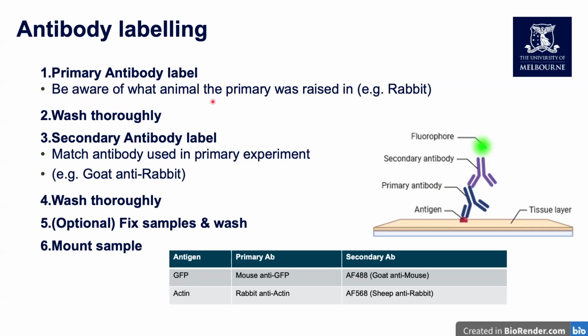A really key thing for us to be aware of there is what animal that antibody was raised in. So was it raised in rabbit, for example?